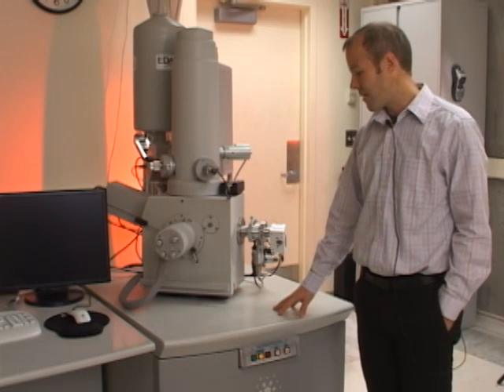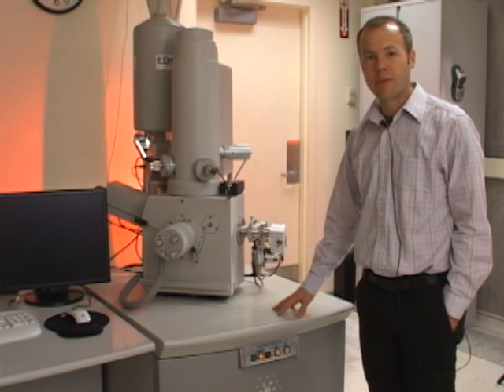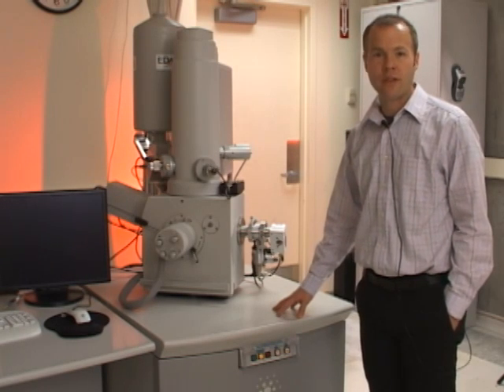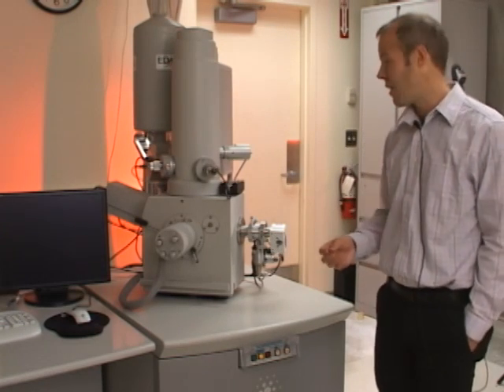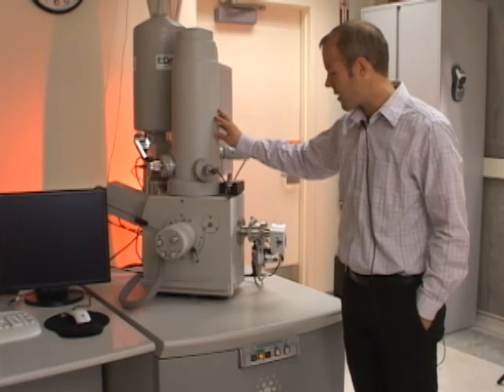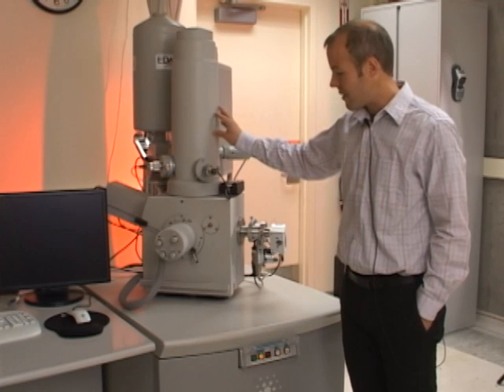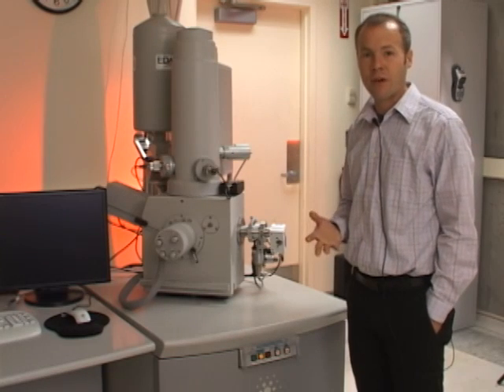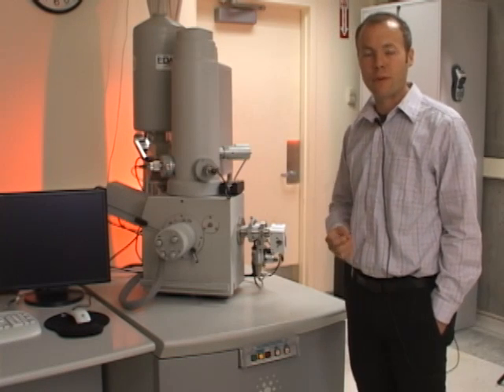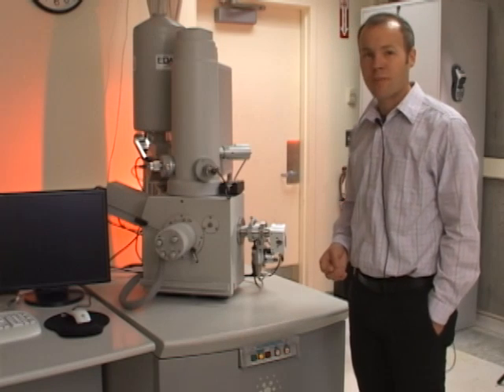There is also a pneumatic isolation system in the table to dampen acoustic vibrations so that you don't see any small vibration in your sample while viewing it. If I push lightly on the column, you'll see it adjusts — the column is floating. That's how we dampen out acoustic vibrations from people walking in the room or talking loudly, so those things don't show up in the image.